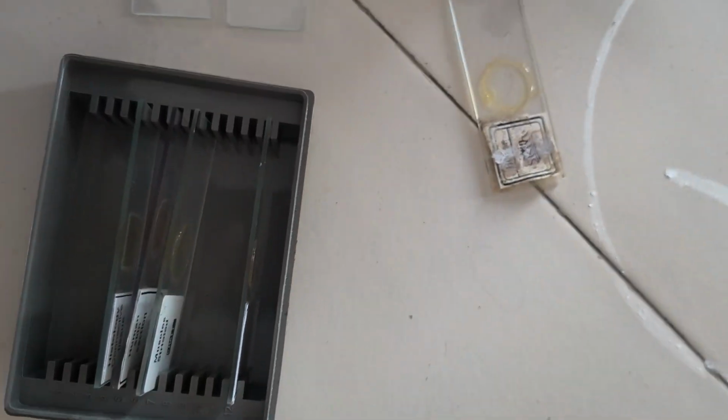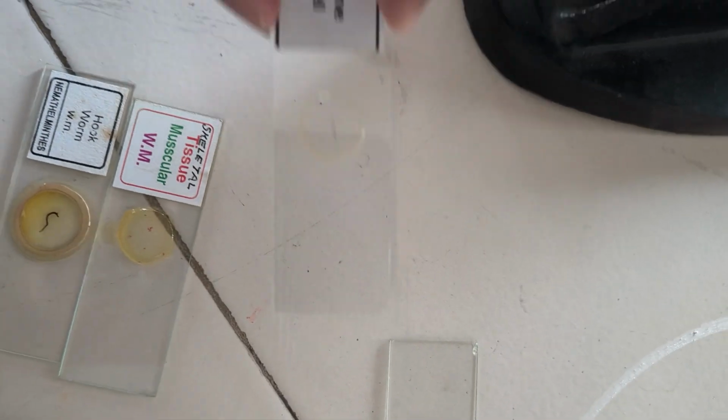Okay, this is the nerve cell. Okay, this is blue in color. Okay, this is a very thin muscle. Let me see it first.